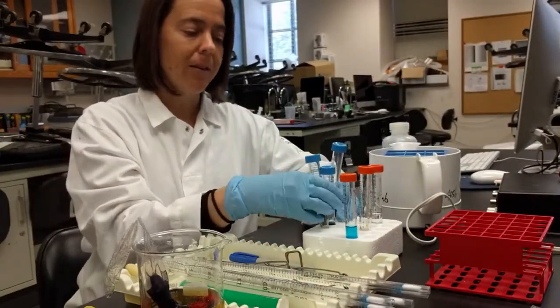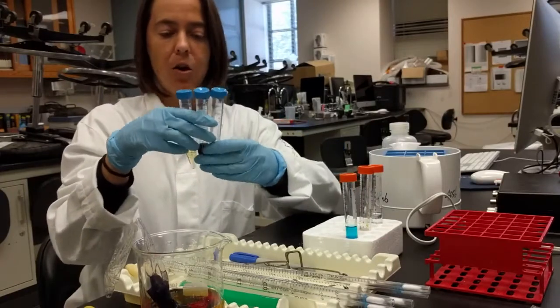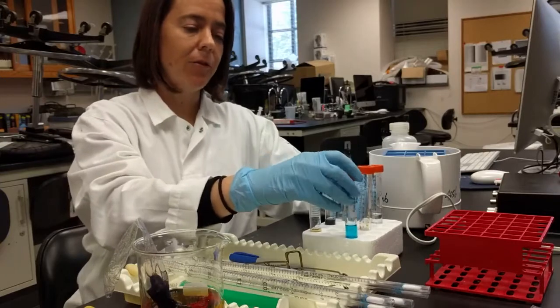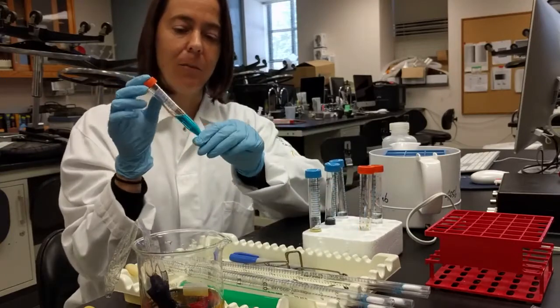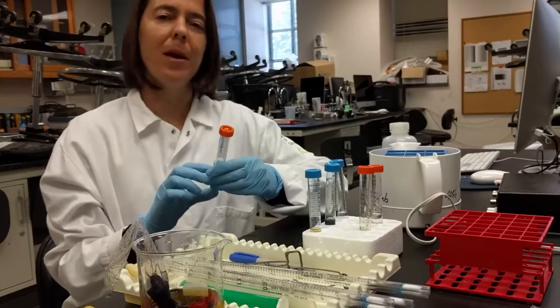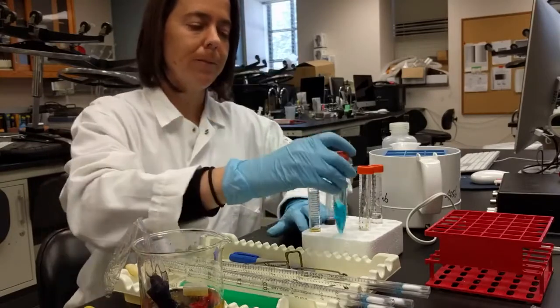Okay, so we have about the same amount of liquid in all 3 tubes. And now we need to add the Benedict's reagent. So that's this thing in blue. And we're going to try and add about an equal amount to each tube. So I'm going to do about 1 pipette full for each one of those tubes.